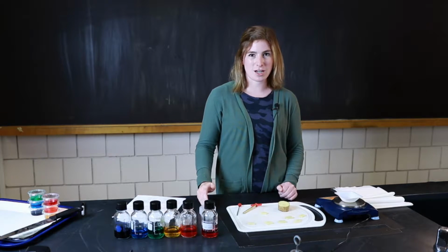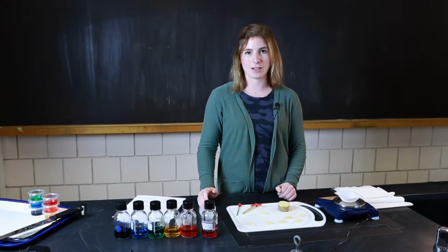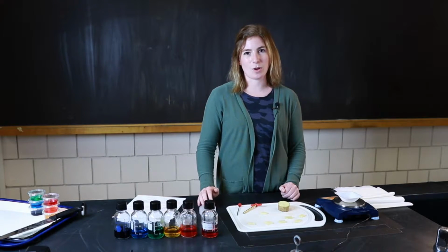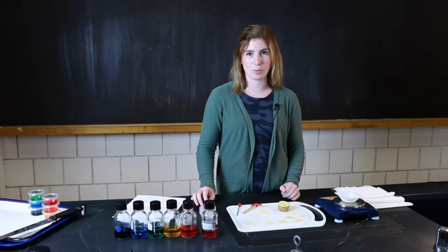So what I'd like you to do right now is to go back and read the introductory information in your lab handout and read the information about water potential and how it's calculated before you move on to the procedure.